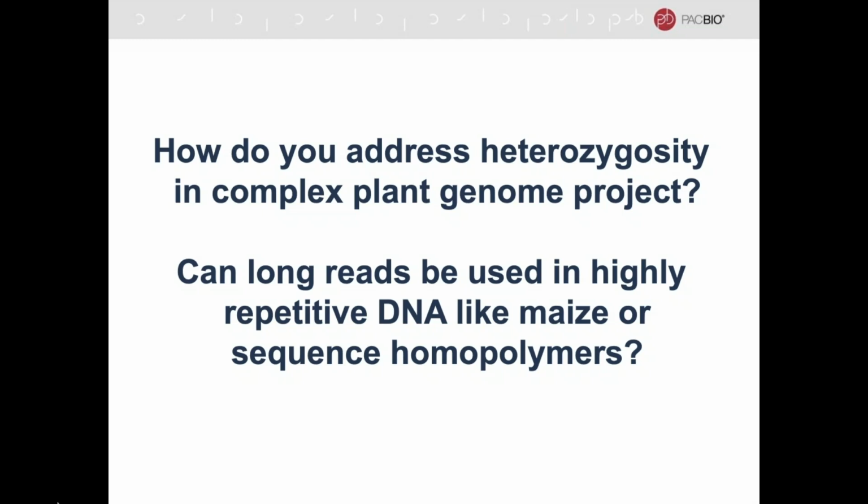Maybe out of a lack of foresight, when we first decided what we were going to try to assemble, we picked one individual that has incomplete parent information and another individual that's a wild native California beach strawberry, which, if it's a wild individual, has no parent information, obviously. So we've actually been able to go back to more of an old school method where we do skim sequencing of a mapping population, and we were able to do recombination breakpoint prediction and map and phase about 4 million variant sites across the genomes.